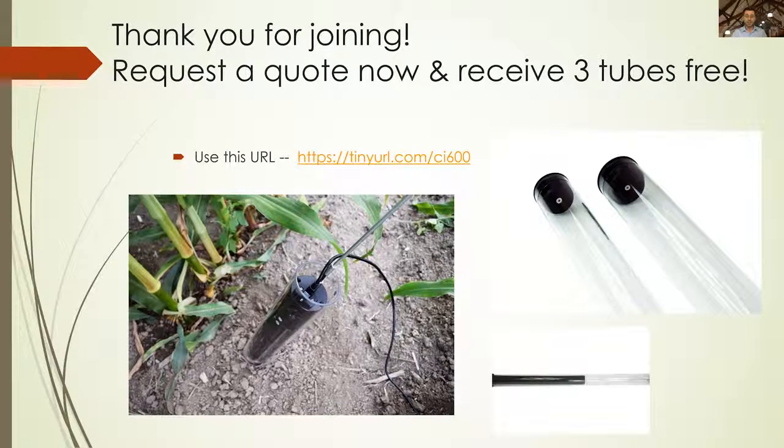All right, the next one is how long does it take to get the total root length of a typical single depth 360-degree scan? If you're talking about the full scan, it really depends on how complicated the root structure is, to be honest. If you have a fairly simple root structure, I've seen it done within 20 minutes or less. If you have extremely dense, very complicated roots and you're mapping out each single one, that is always going to be a longer affair. But the software does some automation. When you draw a few lines, it will try to estimate by the pixels how long those roots really grow. I find that very useful. Towards the ends, it gets a little wonky, but you just snap them back into place real fast, and that makes the process a lot faster.